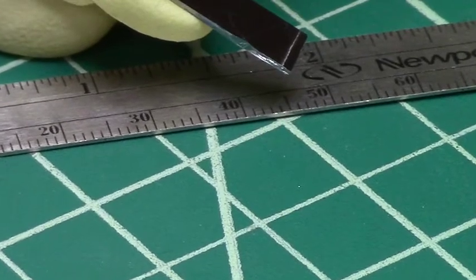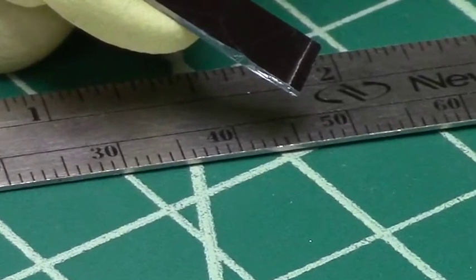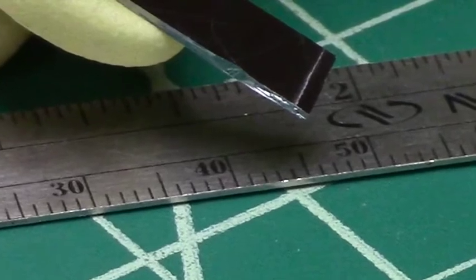Some samples don't cleave with just a short scribe, so a long scribe across the entire width of the sample is required.